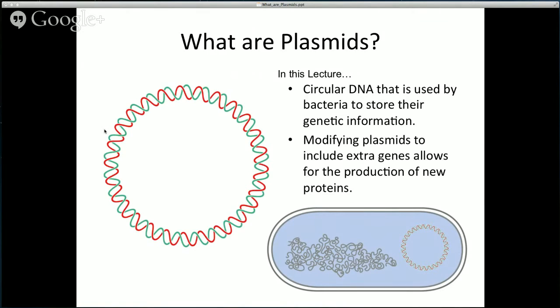ADP1 had the gene for creating the enzyme to break down para-hydroxybenzoate, and we forced the other strain to take it up via natural transformation in order to then express that enzyme so it can live on a para-hydroxybenzoate plate. Okay.